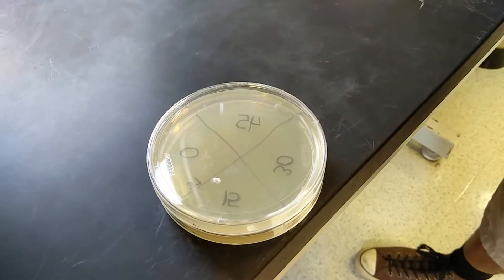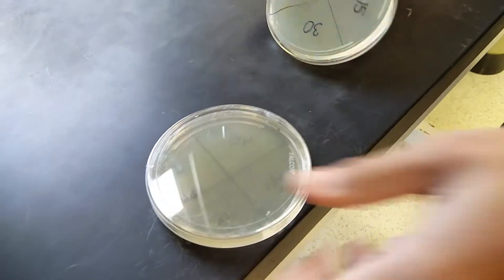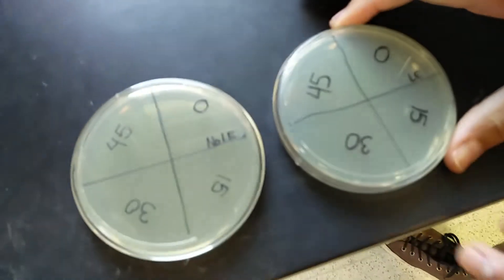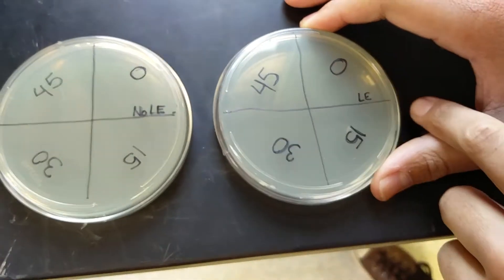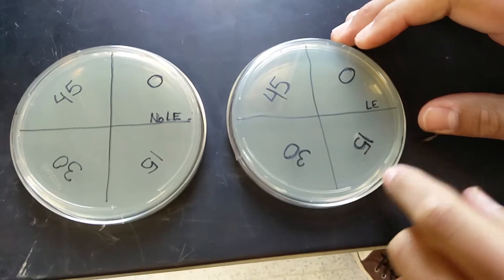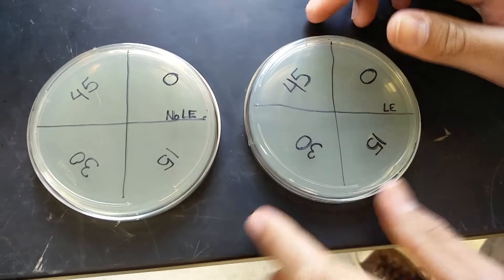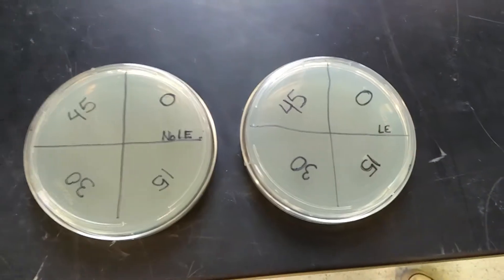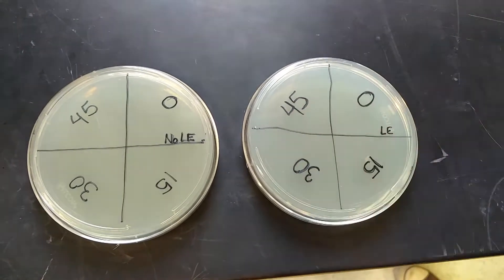First, you want to label your agro plates. As you can see I've already done this. You go on the bottom of the plate and divide it into quarters, then you write 0, 15, 30, or 45 on both of the plates. These numbers correspond to how many seconds you'll be exposing each of these sectors to the UV light.